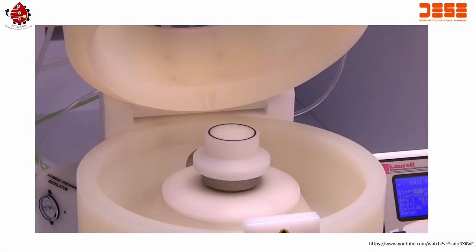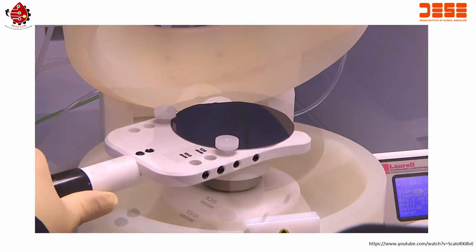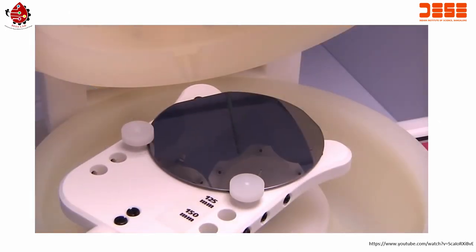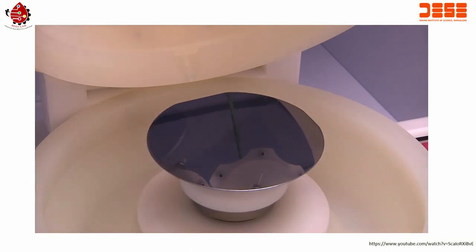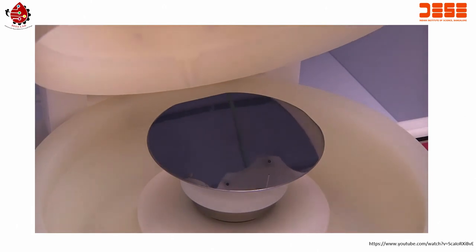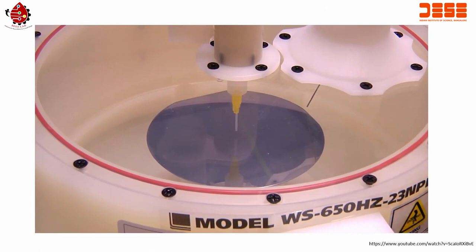It is most important to begin with a correctly centered substrate. Here, we used a Laurel Technologies alignment tool to guarantee consistent, accurate centering. Consistent centering allows you to set up the UD3B to accurately remove just the edge bead without having to reset for each substrate or remove more of your coating than is absolutely necessary.